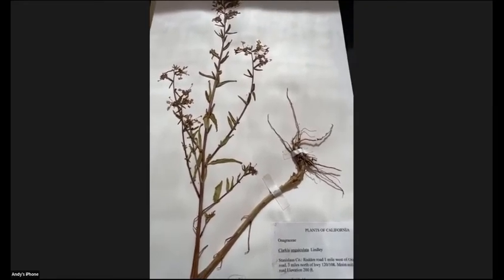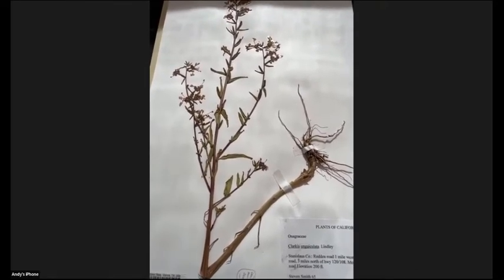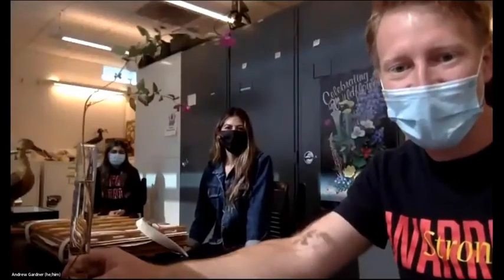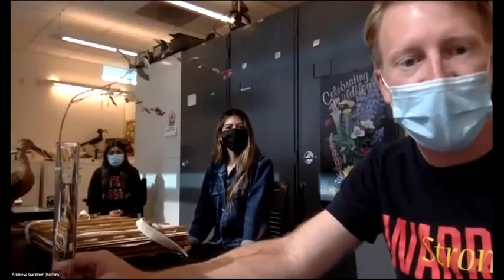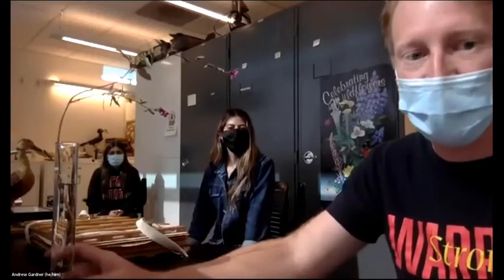Okay, so now that we've talked a little bit about collections and natural history collections, what we're going to do is shift to talking about how we make plant specimens. So what we've got here is a plant. This happens to be elegant Clarkia, the one that we showed you earlier, that specimen. So we'll show how we make that. And some of you, in fact, have some Clarkia in your kit, so you'll be making a specimen just like we are.